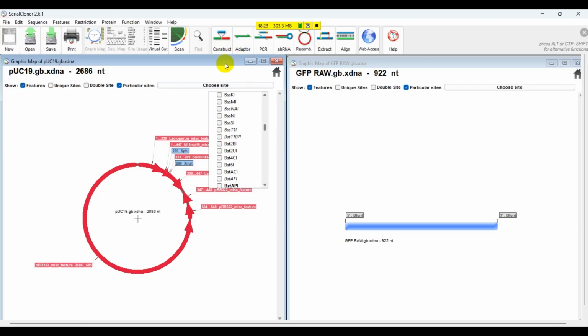So now the main thing is why we are doing PCR and why we are adding these restriction enzymes here. The answer is, if we successfully ligated two sequences here, the restriction enzyme site, then after PCR, which means making millions of copies of DNA, the region that you want to amplify will be amplified with millions of copies.